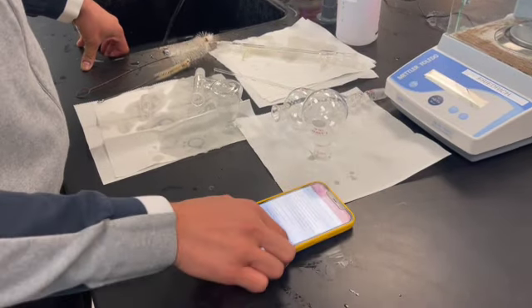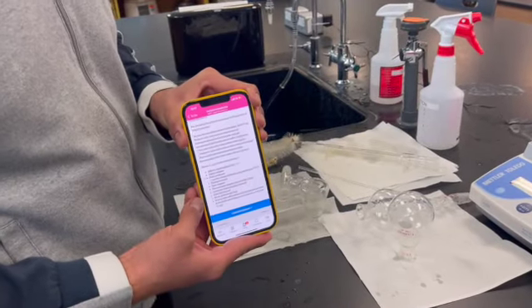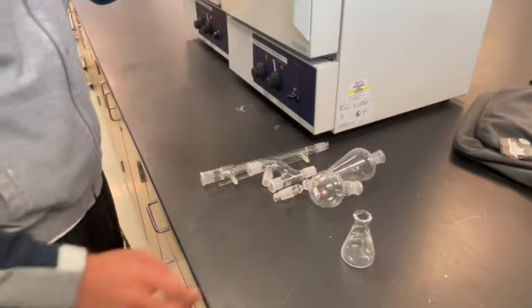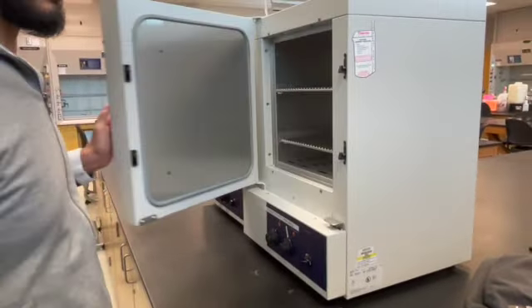We begin by reading the instructions on Canvas stating which glassware we should wash and dry out. Then we will put our materials inside the oven so they can dry out for two days.